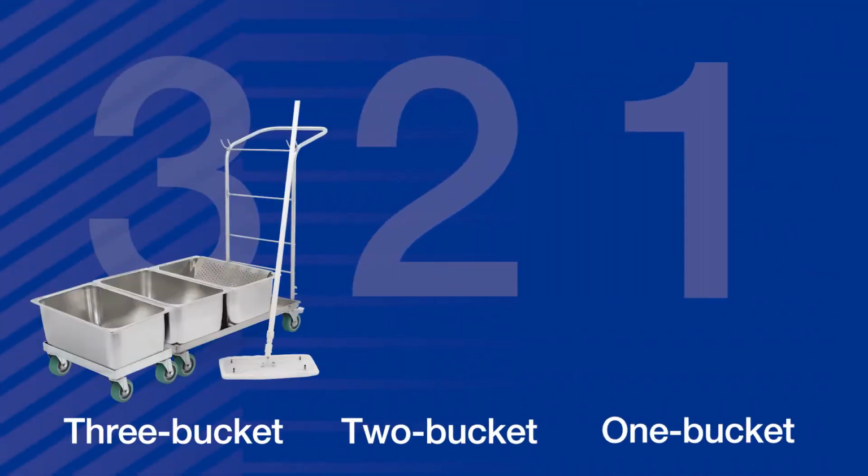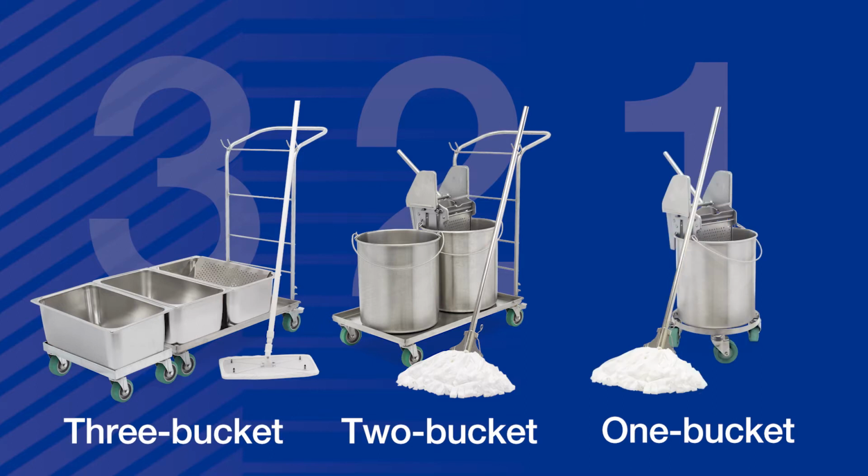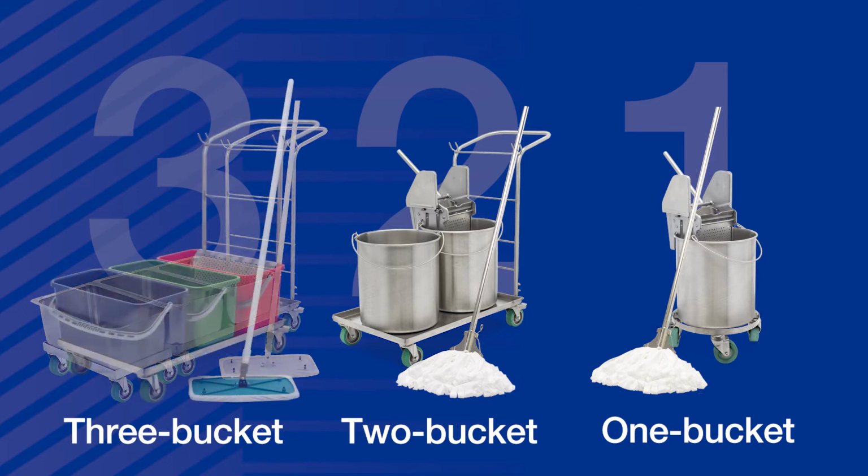There are 3, 2, and 1 bucket systems. The 2 and 3 bucket systems are considered more effective than the 1 bucket system. The 1 bucket system promotes faster contamination of the disinfecting solution from the surface. The bucket system may also be plastic.